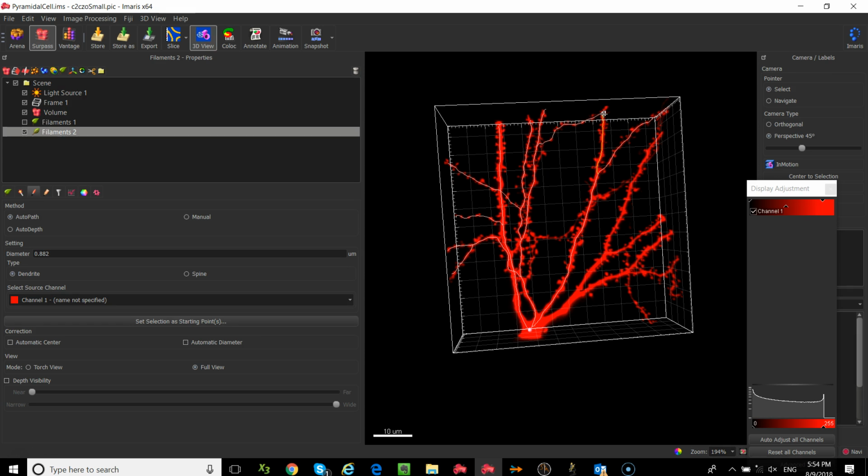It's been optimized to be really fast, but it's more typical when people are looking at big sections that there's particular neurons that they may have. Maybe it's transfected, it could be injected, whatever it is. But this is usually the way that they would go about it. Rather than having everything considered as an option, they focus in on what they actually want to measure. And this tool, as I said, can actually generate your statistics faster than doing it automatically.